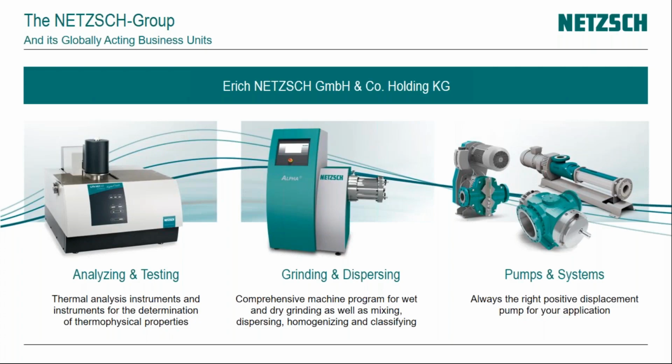I am working for the analyzing and testing division, which has the thermal analysis instruments for the determination of the thermophysical properties. I will go into detail about some of the products we have in analyzing and testing in the coming slides. But the main topic will be differential scanning calorimetry.